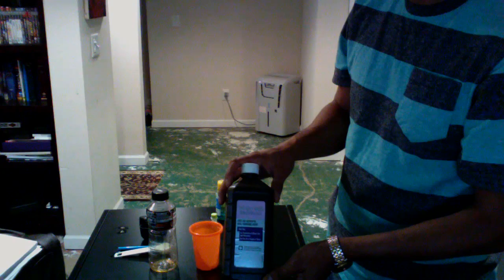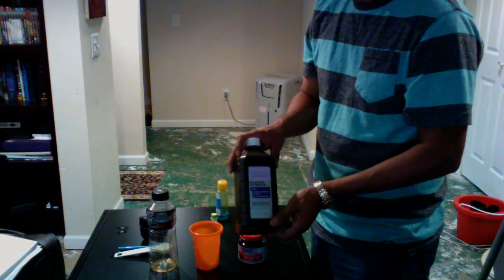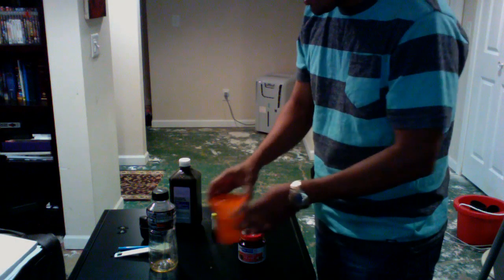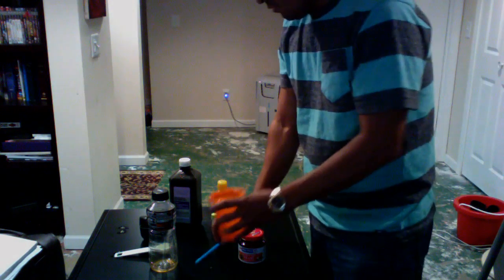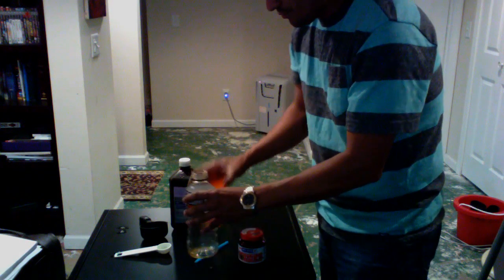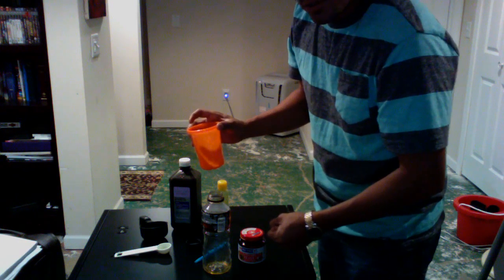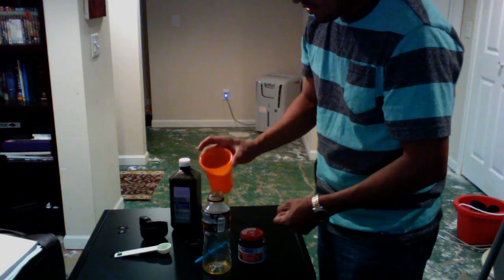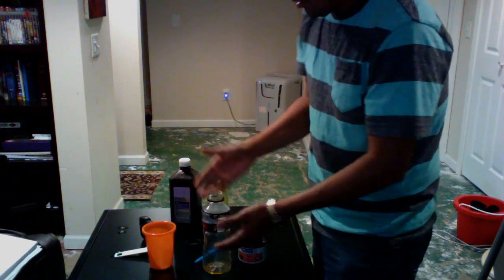So we want that extra O out of there, so it just stays H2O. So we mix, we stir it up so no crumbles are in there, and we're going to pour this carefully, and you're going to see what is also called elephant toothpaste.